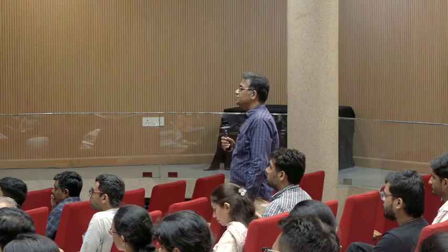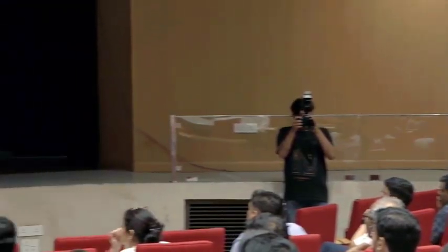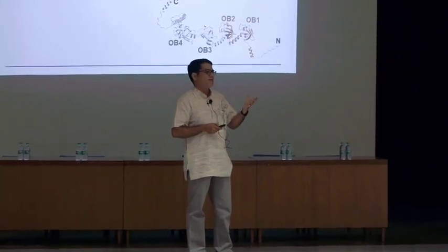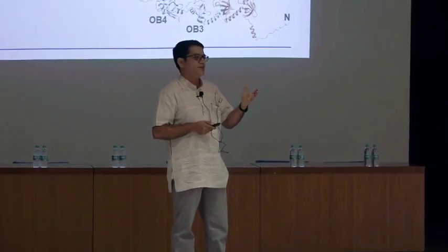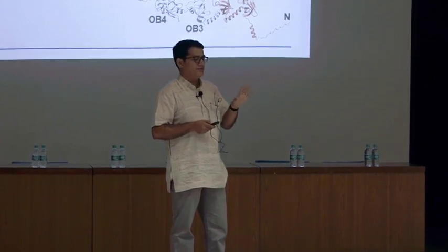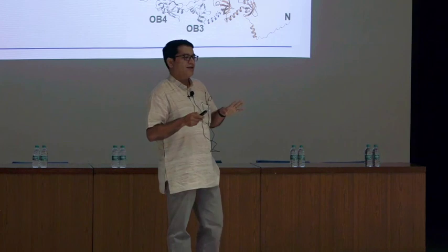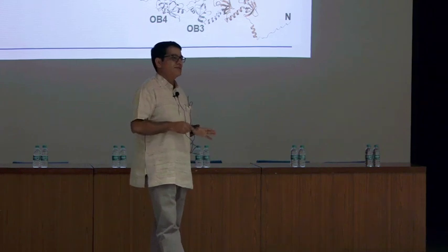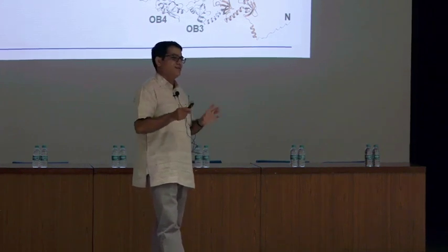Ours is from 2.5 best to 3.5, but if you want to see the modifications that people have shown, you need like 2 angstrom, or 2.1 angstrom. So we didn't attempt to find out. But with cryo-EM 2 angstrom ribosome structures, people are showing a lot of post-translational modification. It's very much evident, you can clearly see.